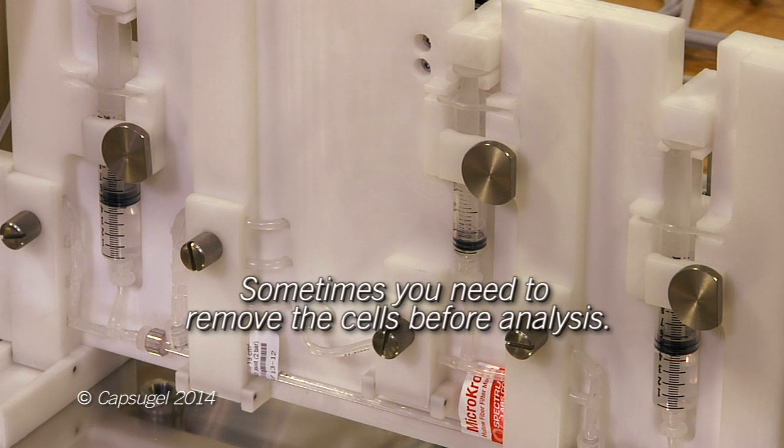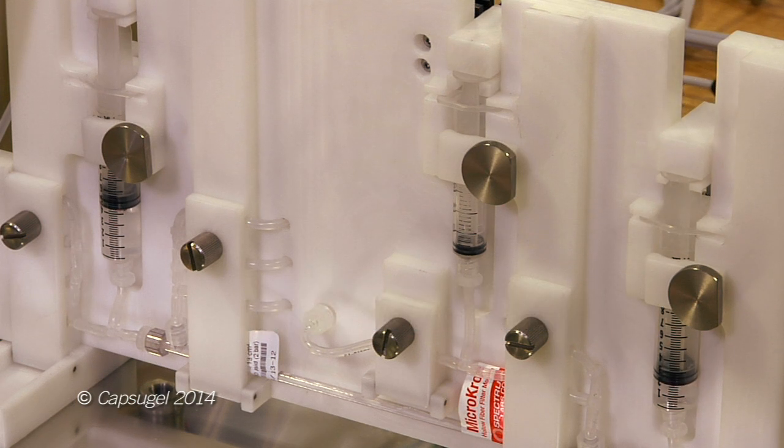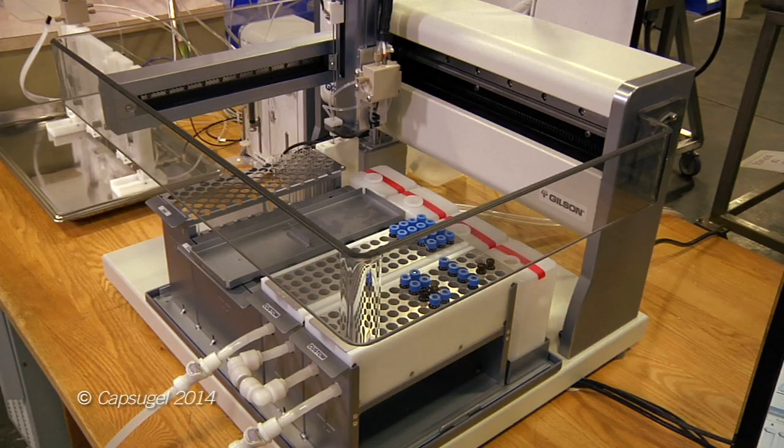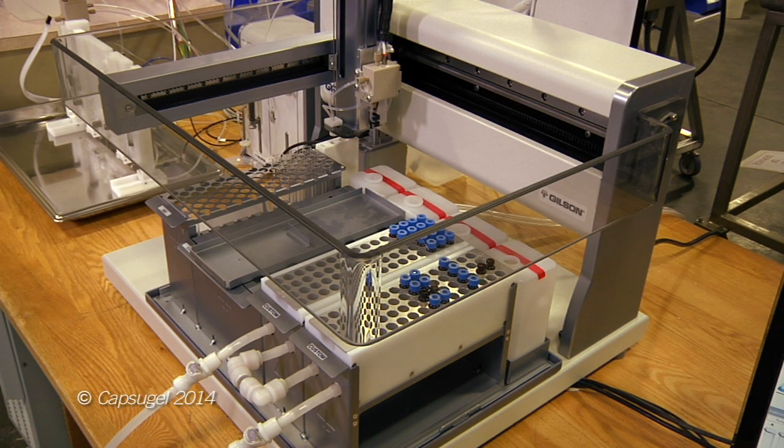A new MAST module in beta testing is the automated cell removal system. This system automatically removes the cells in a whole broth sample, providing a clear cell-free aliquot for analysis. The MAST system can then transfer this cell-free aliquot to other downstream devices such as liquid chromatographs or mass spectrometers.